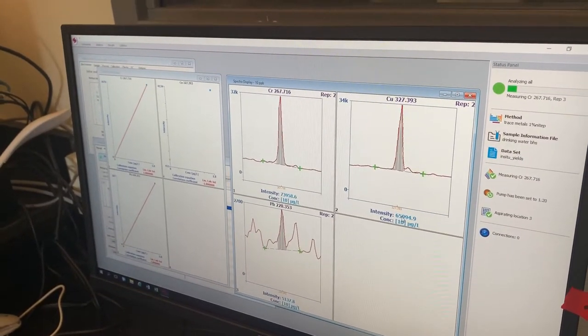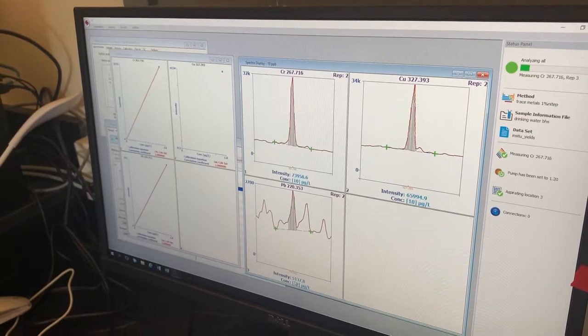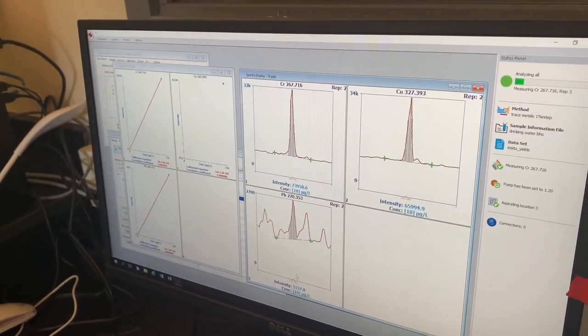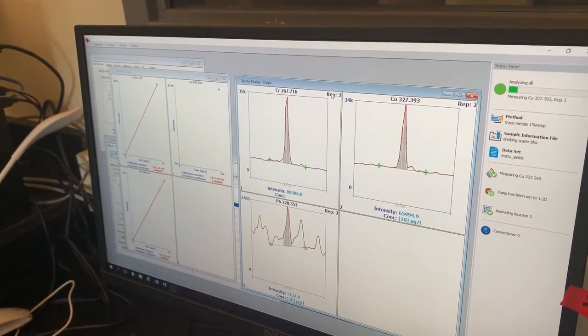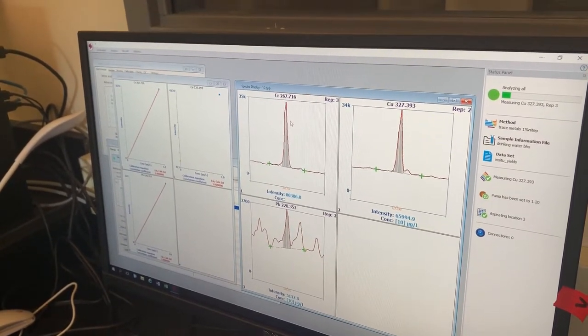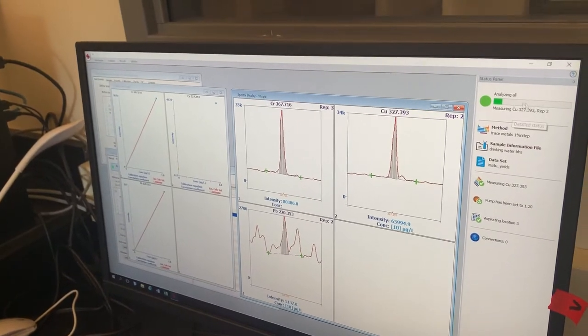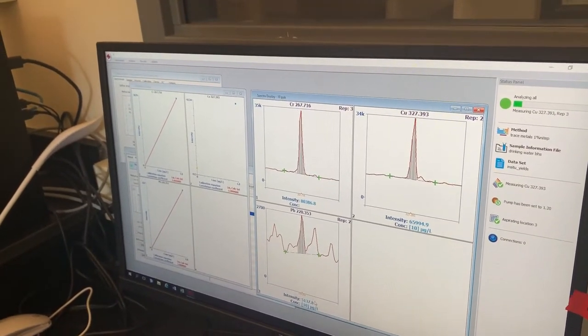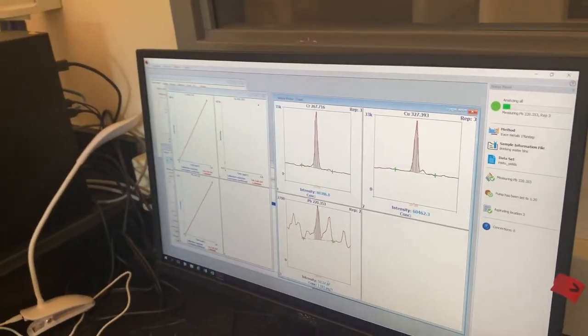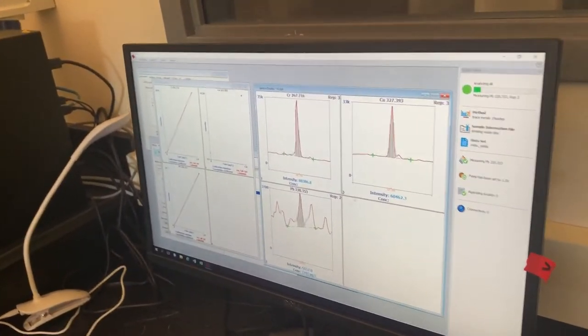And in the 10 ppb standard, we get an intensity of about 74,000 counts for this chromium peak. For copper, we get about 65,000 counts. And for lead, we get about 5,000 counts. And again, that's 10 ppb. We're making three replicate measurements of each on here. So we've done the third replicate for chrome. Right now, we're working on the third replicate for copper. And then we're going to do the third replicate for lead. So we always want to make repeat samples here in the machine. You can hear the machine going back and forth. It takes a couple minutes to do each one of these.